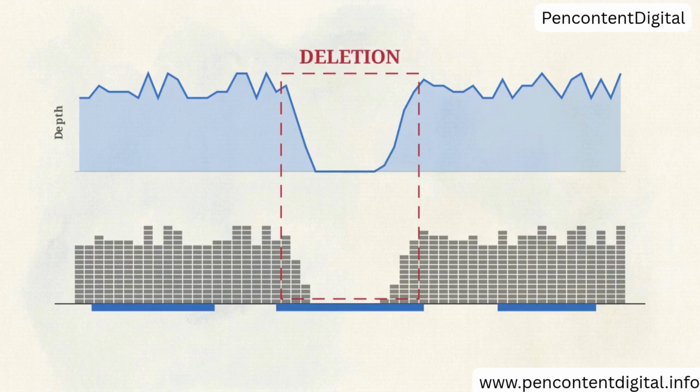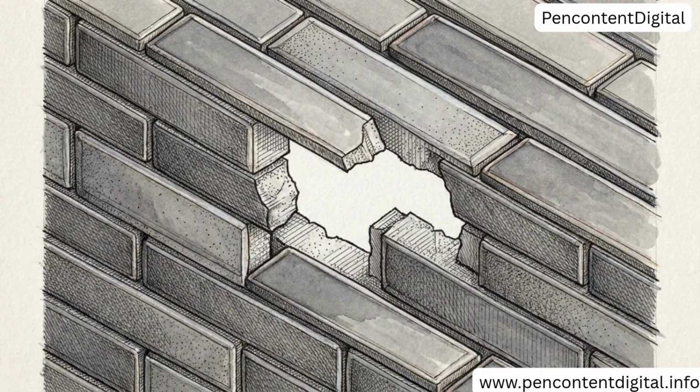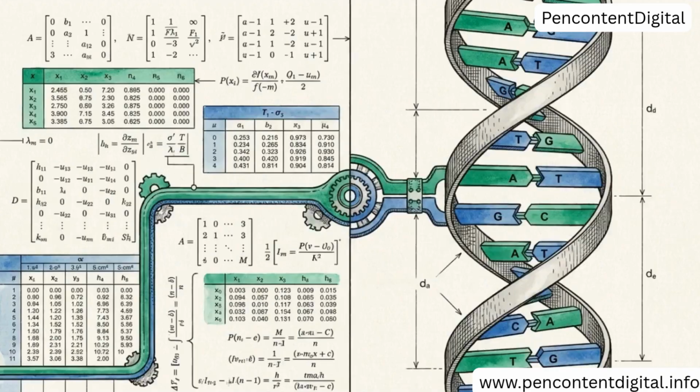A localized drop can indicate sequencing biases or a physical deletion in the DNA. Inspecting the physical patterns in this stack, such as soft-clipped edges or unusual gaps, allows researchers to identify structural variations that automated callers may overlook. Visualizing the BAM layer maps the mathematical output of the aligner into a spatial representation of the physical DNA.